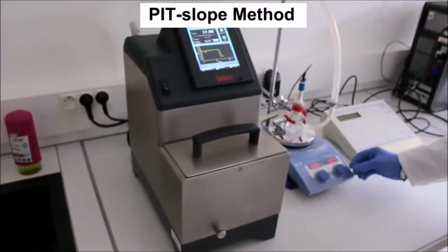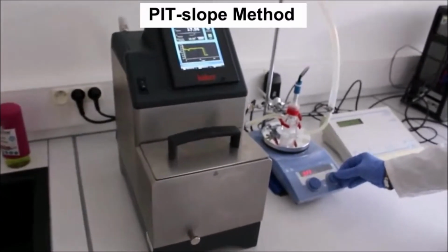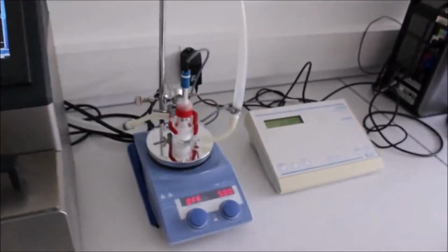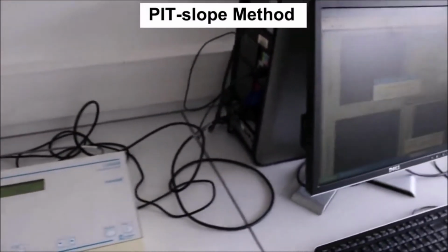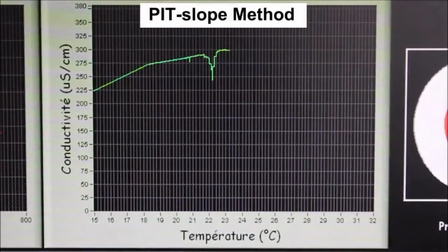The experimental setup for the PIT slope method is made up of a temperature-regulated bath, a small reactor with a magnetic stirring system, a conductimeter, and a computer to record the conductivity values as a function of the temperature and time. The reference system is placed in the small stirred reactor connected to a thermostatic programmable bath at 18 degrees.